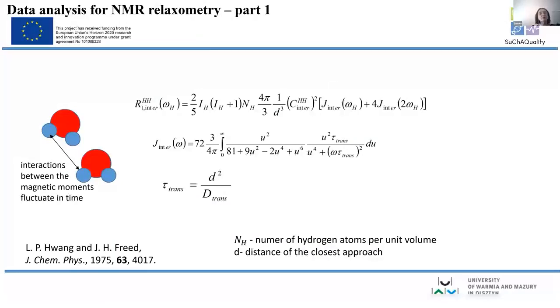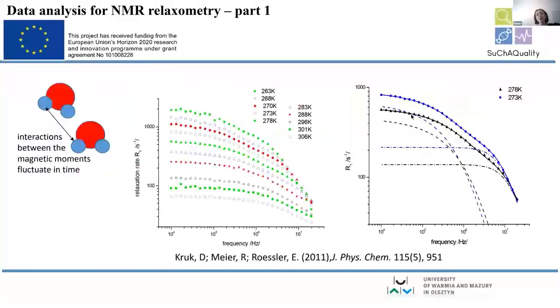I will need software for that and so on. Actually, we have software for that, and I would be happy to give this software to you. But it may happen that you can profit from NMR relaxometry data in a simpler way. Do you remember this thing? When Messi asked me the question, what's that actually?